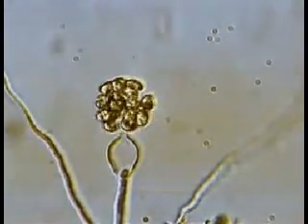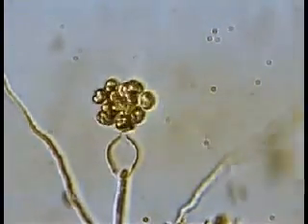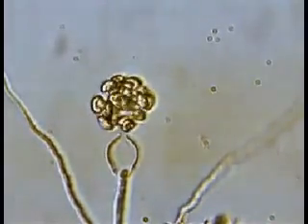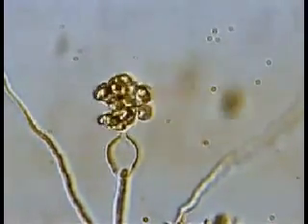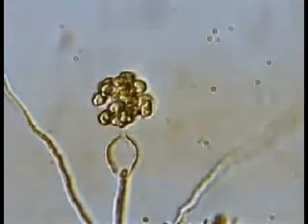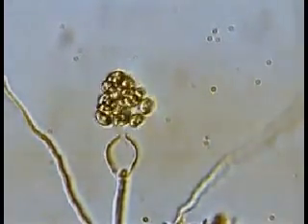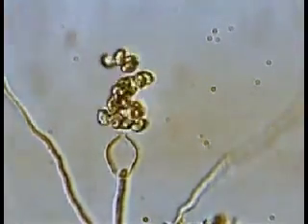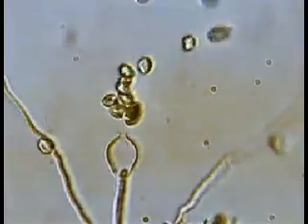And what you'll see towards the very end of this video is that one of the zoospores gets trapped in the vesicle. And if you look very carefully, you'll be able to see part of the vesicle down in the lower left-hand area. It almost looks like a little line or a little faint shadowy area. But eventually that zoospore is released.